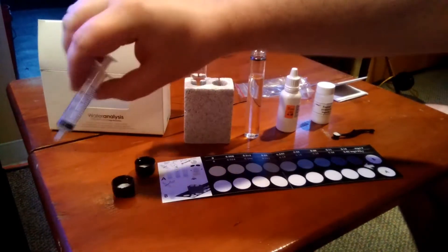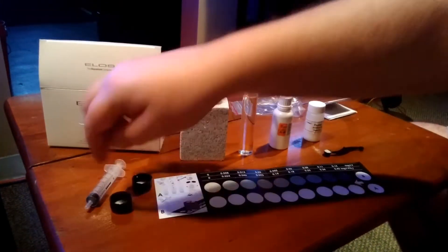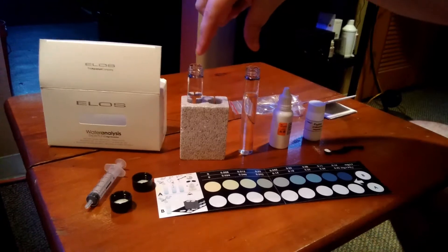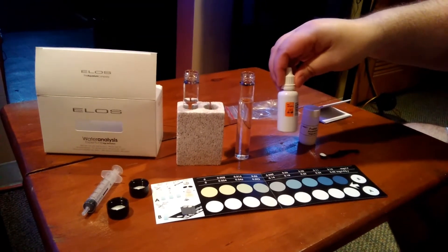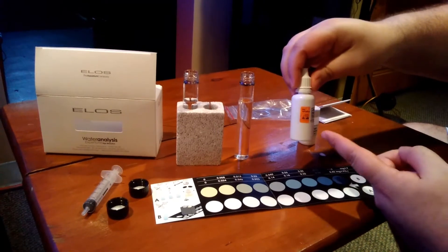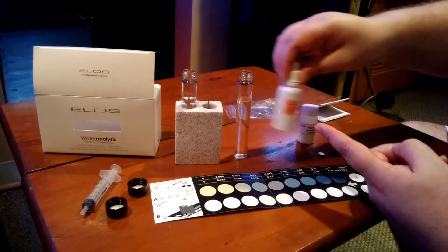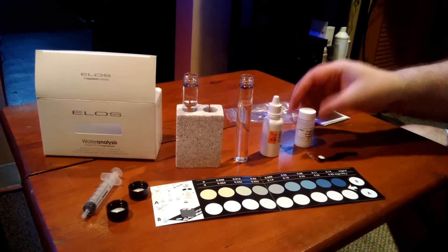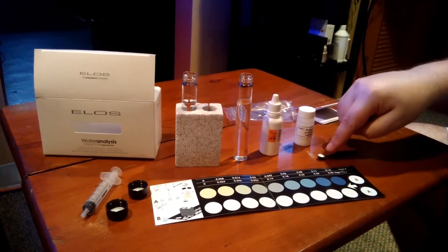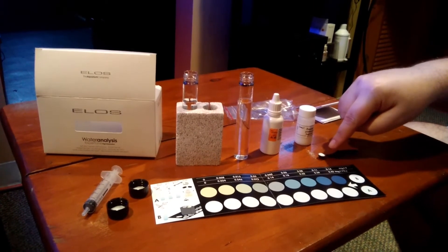First, you start off with your syringe, your two caps for the vials or test tubes. You have one reagent which is a liquid and it has a corrosive symbol on it, and you also have your second reagent which is a powder — used with the spoon on the four milliliter side.